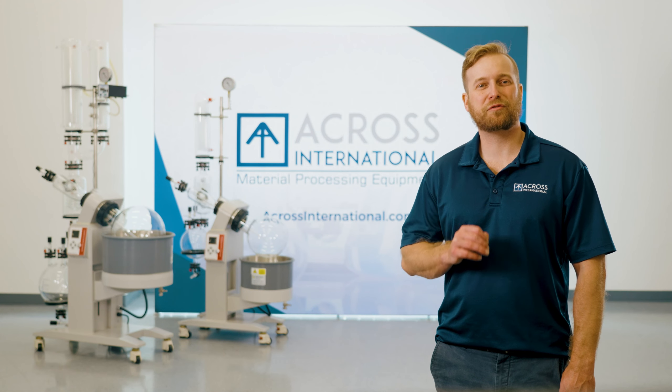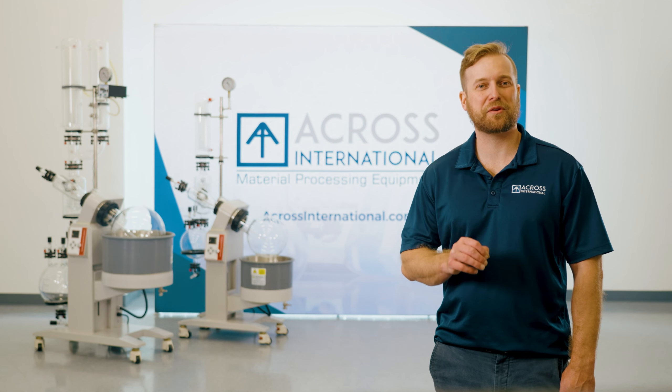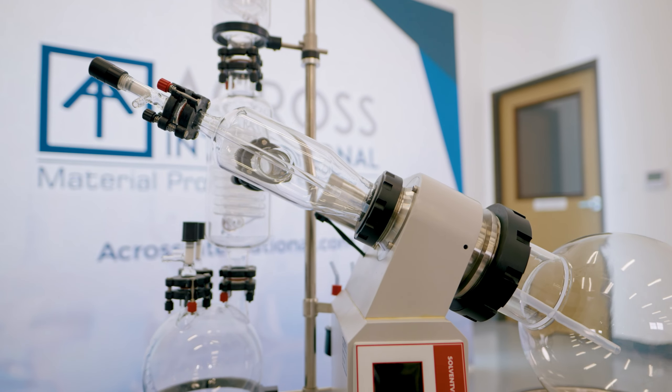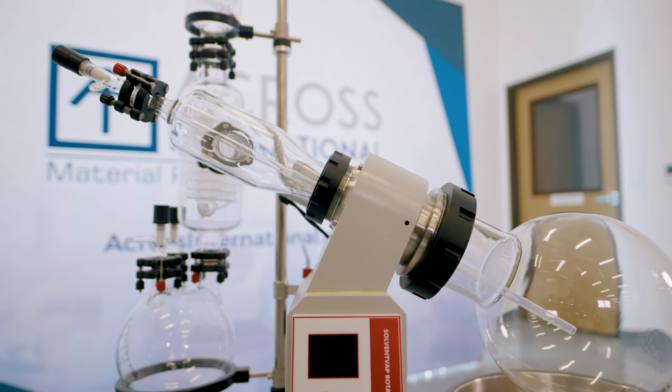We understand that conformity and compliance can be essential, and that is why all of our Rotary Evaporators carry UL and CSA certifications free of charge.